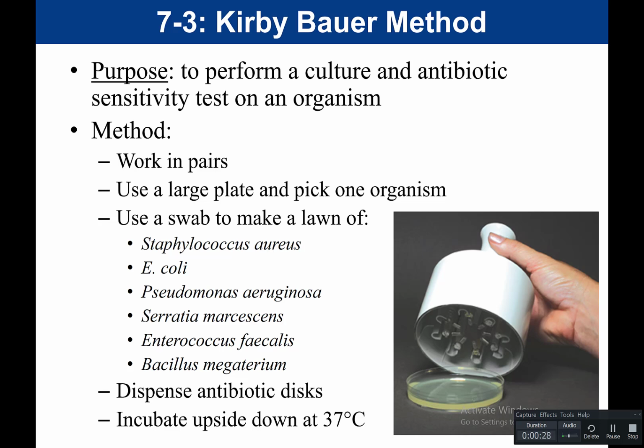Essentially what that means is that we want to know what antibiotic would be the best choice against a particular organism. So let's say, for example, that a patient comes in and they have a UTI, a urinary tract infection, and the doctor wants to know what drug to prescribe to that patient. So what we would do is we would first start by getting a urine culture, right? So the patient would give a urine sample. Then you could take that bacteria and streak it on a plate.